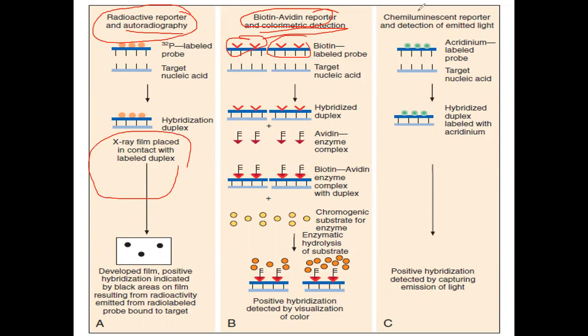Next, if you are using acridine labeled probes, so acridinium yung label mo, ibig sabihin these are your chemiluminescent reporters. Then you are going to read the result using chemiluminescent assays. The result is indicated by the detected capturing emission of light.